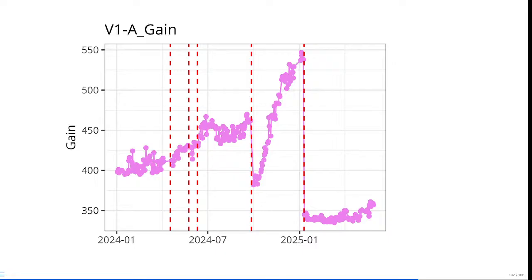And it allows us to start pinpointing when our detectors or our lasers start to fail. So this is preempting what we're having as far as when we actually see the QC report fail for Cytek. We have at least a month warning in advance before the actual fail mark is reached. So we're able to actually go and schedule the field service engineer to come out.